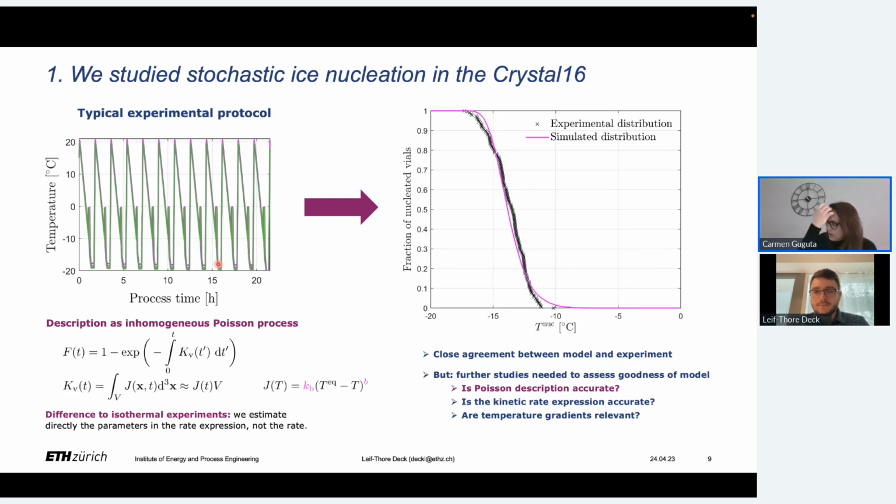So once it's detected that you have something crystallizing out, forming in your solution, then it automatically goes to the next step. So you save some time, of course, if you have to do a lot of cycles. No, I'm pretty sure we don't have it actually the way you describe it. I think especially for crystallization you can save a lot of time. Yes, indeed. For crystallization, there is really an added value.